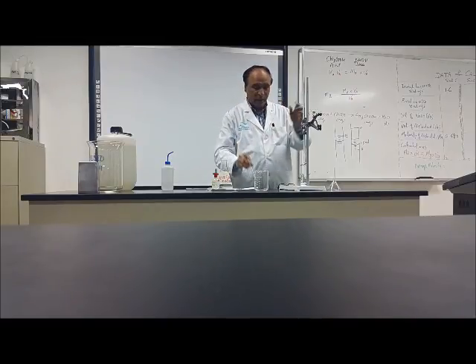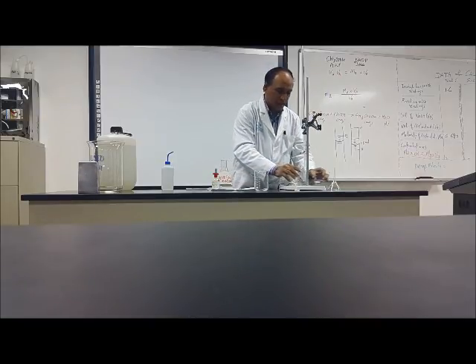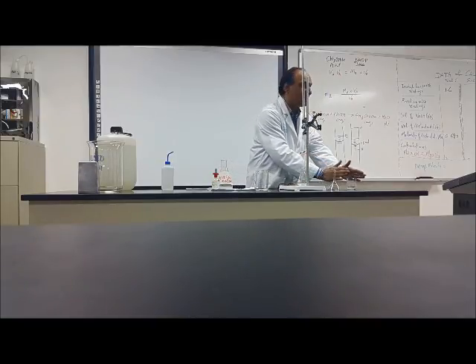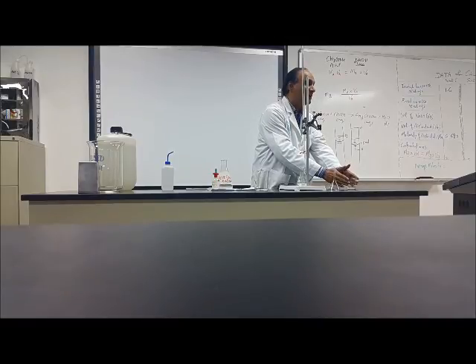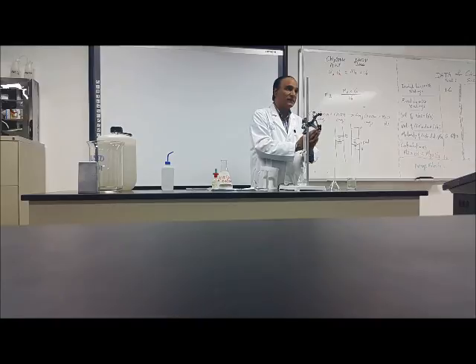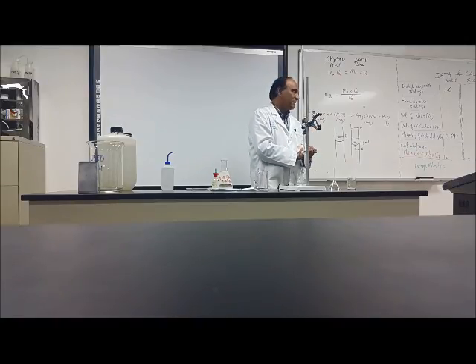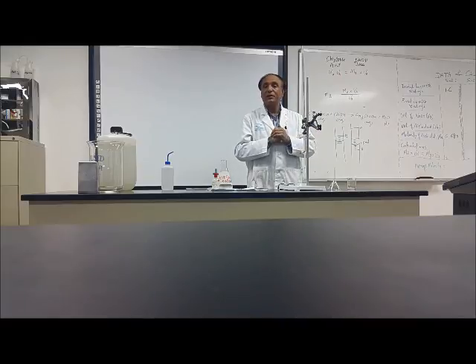Now everything is ready to do the titration. This is a beaker. Keep it on one side. What is in the beaker? Sodium hydroxide. So we may use it again. So keep it on one side. Don't put water. Don't put anything in that. Don't put any washing in that. No waste there. Did you understand, boys?